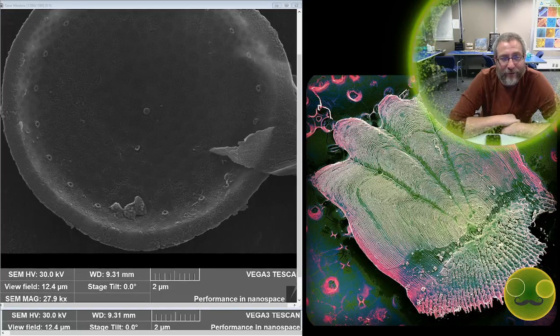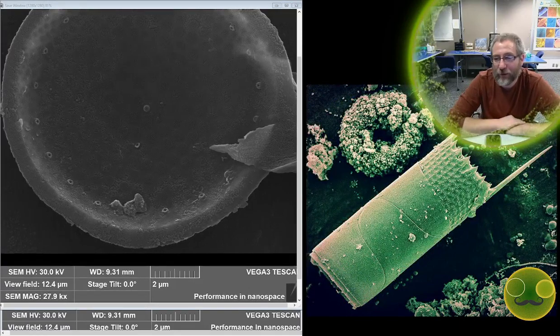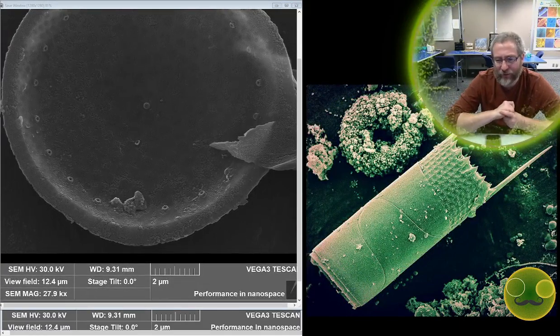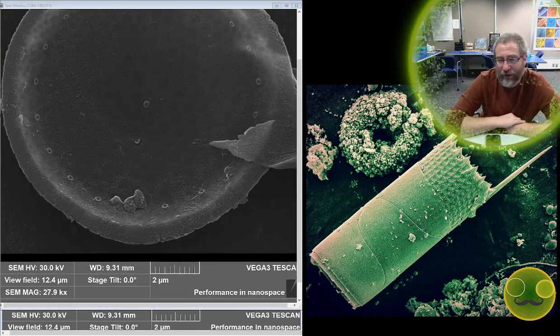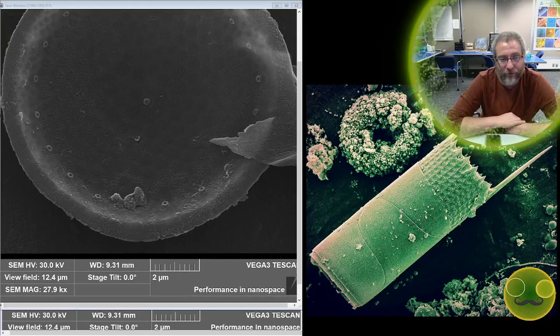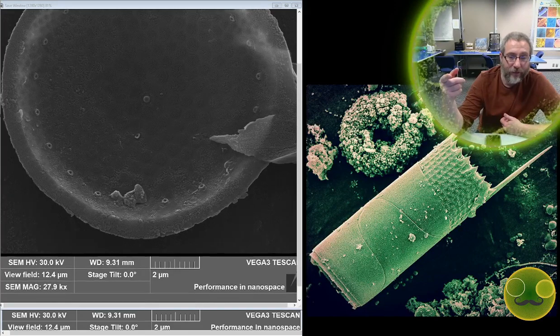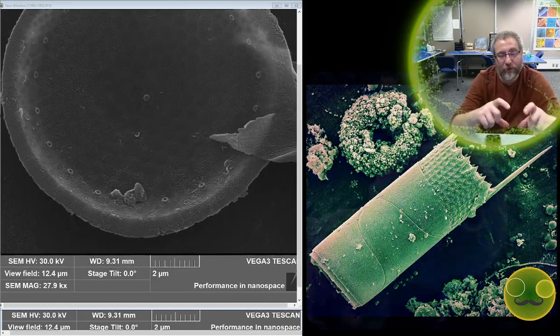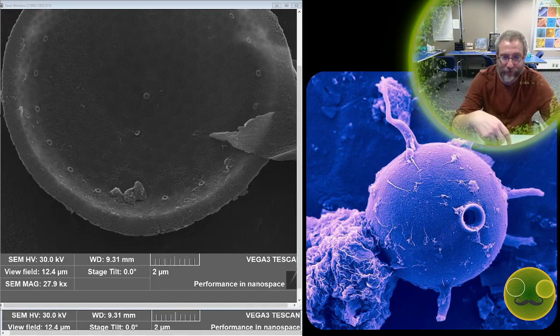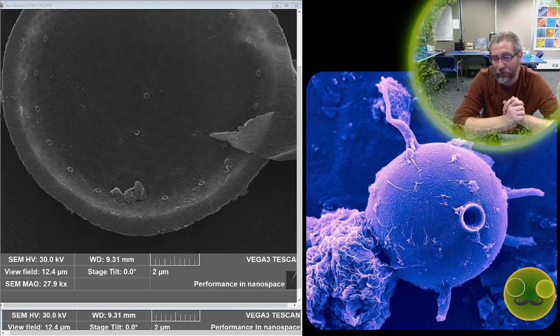Some of the things in here, like all of the things in here, should be clones of the same organism. But one of the samples, the material was super small, and I'm not sure that we actually have any of it that was preserved very well. And so I'm working on going back through. When we processed the sample, I had my lab technician split it in half, so only half went into what we were actually processing, and so I have half of the original sample that was sent to me.